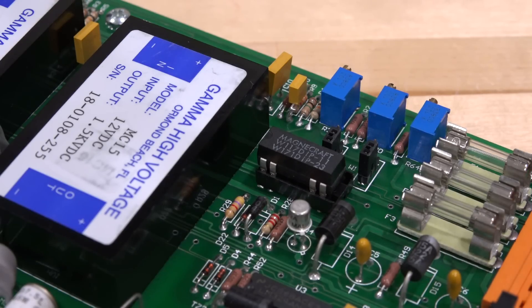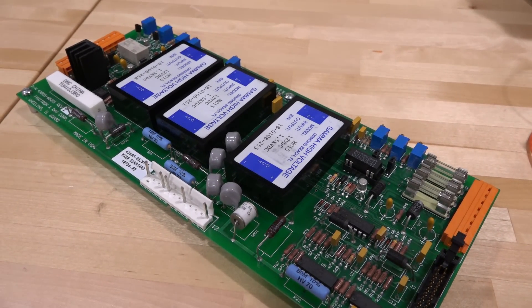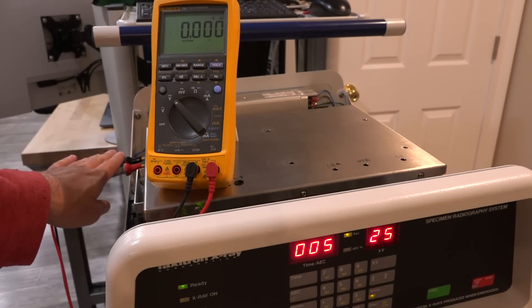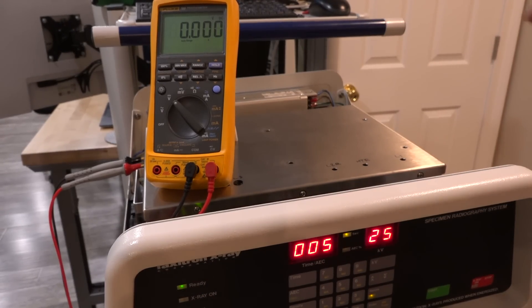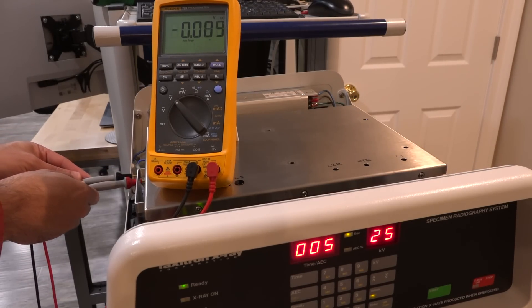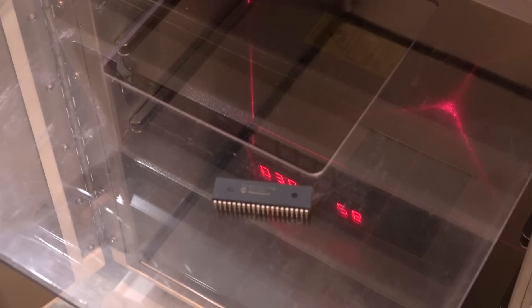Here's our replacement reed switch, now sitting in a socket so it's easy to remove and replace in the future. We have to put the entire machine back together before we can test it. The machine is now back together in a safe configuration. I want to verify the tube voltages haven't been affected, so I'm measuring the tube voltage — currently at zero because nothing is active. Let's take an image to check. There we go — pretty well calibrated: 25 kV, and the reading of 2.5 multiplied up is exactly where it's supposed to be.